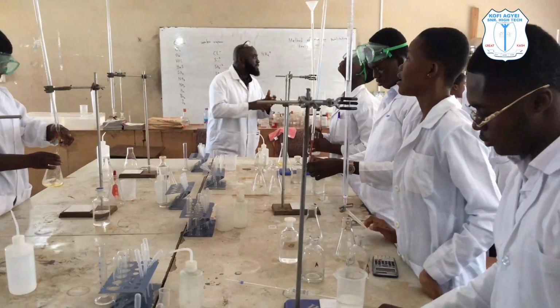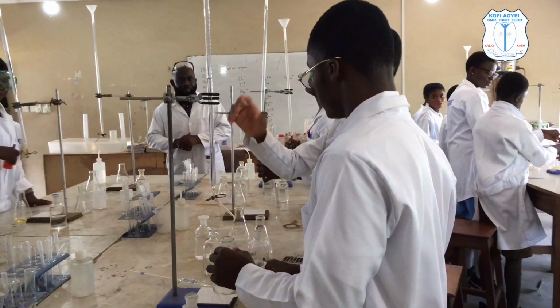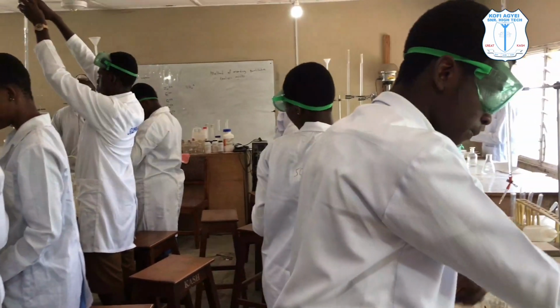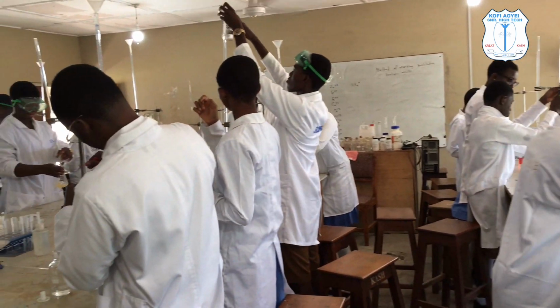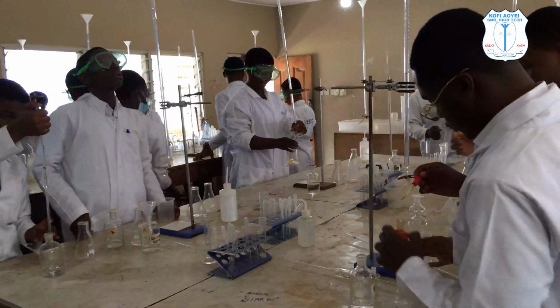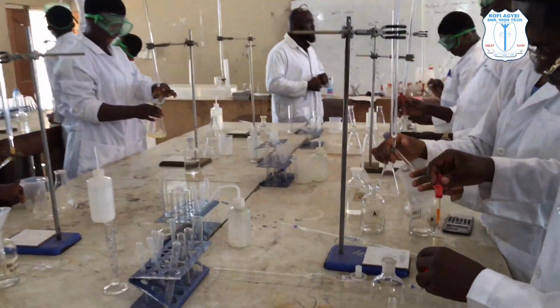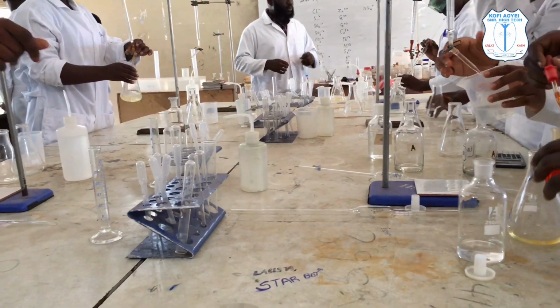So after setting everything up to the 0 mark, what do you do? You pipette the base. So here we are using what? The methyl orange indicator. You pipette the base nicely, then you add 3 drops of the methyl orange indicator into the base. Then you start with the titration. So hurry up.